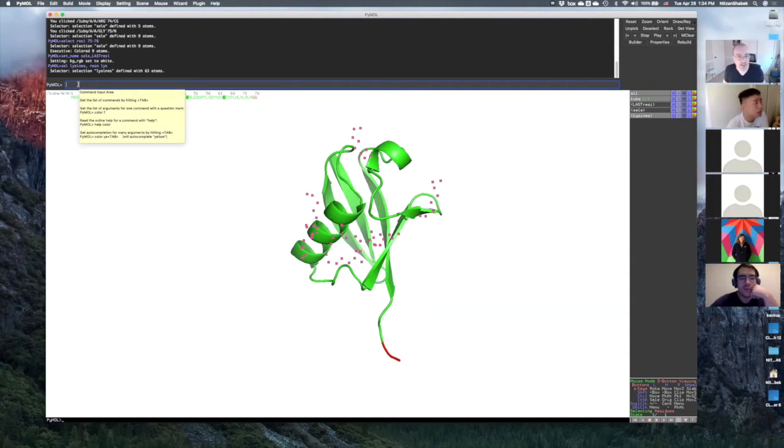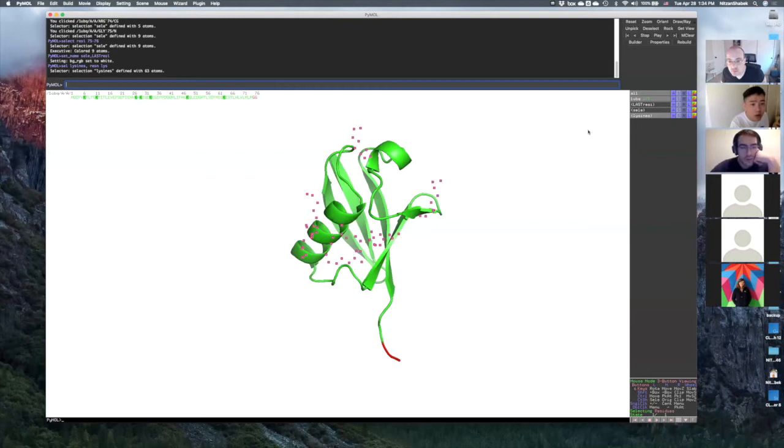You press SEL, the SEL will form a new selection line here. We call this selection line lysines. You can call it whatever you want. And then this comma is important because then it tells you what you want to select within this selection. And then you write RESN, meaning residue, and space and LYS. LYS is the 3 letters for lysine. Okay? Do you have to use the 3 letters, or can you use the single? You have to use 3 letters for residues, yes, in PyMOL.